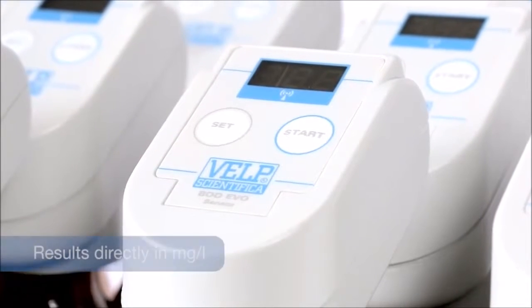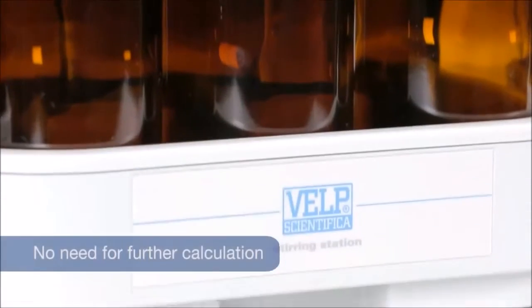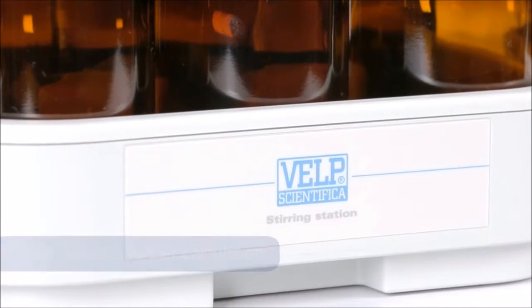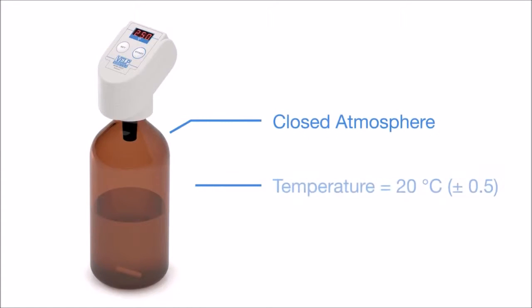The VELP Sensor measures the BOD value directly in milligrams per liter, with no need for further calculation. It uses the respirometric method in a closed atmosphere at a constant temperature of 20 degrees centigrade and with gentle sample stirring.